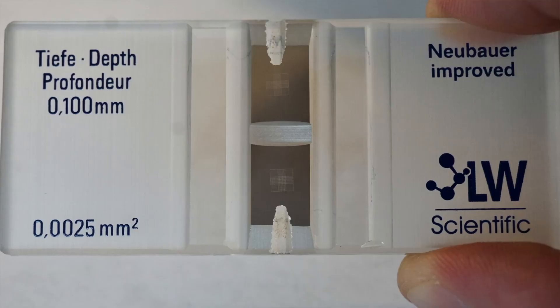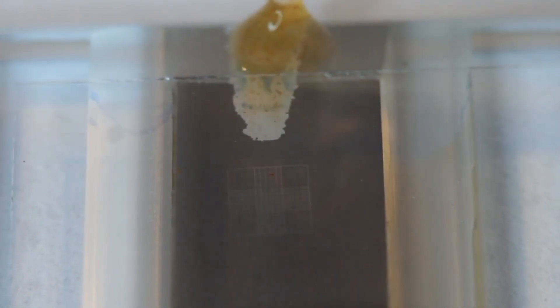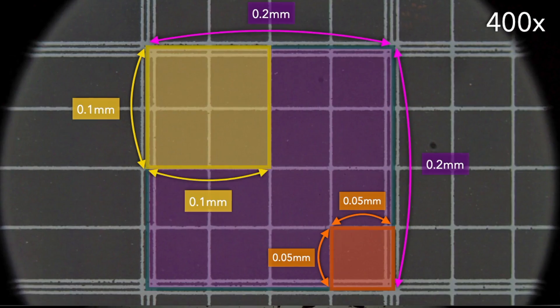The hemocytometer is a grid slide that's standardized across all sciences that use the microscope — biology, lab-based science, virology. This is the standard, and the math is the same regardless of context. It's accepted through labs all over the world regardless of the language you speak. It's math. It's simple, clean, clear, and irrefutable. We can scale up and lean upon that number per gram, per milligram, per milliliter.